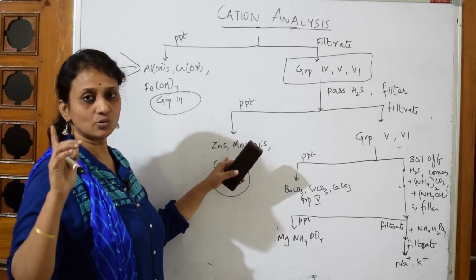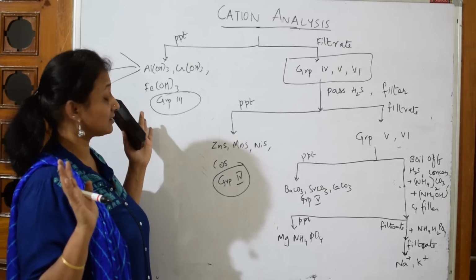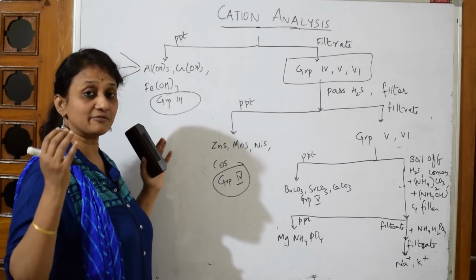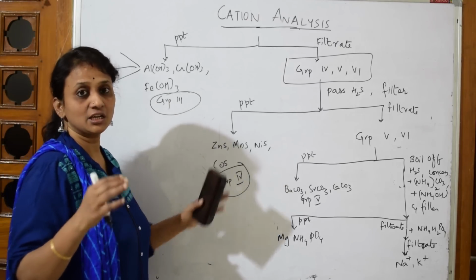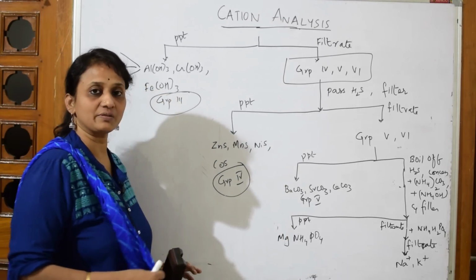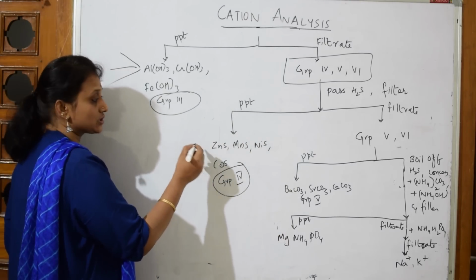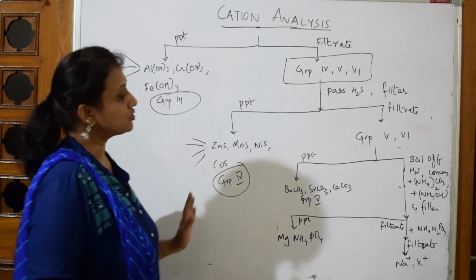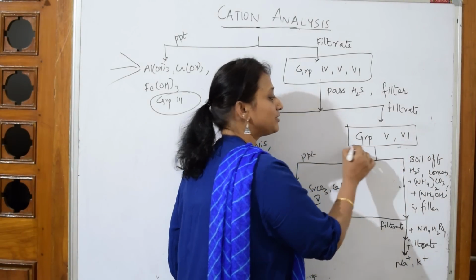First we have written chlorides, like that one after the other. Chlorides we have seen. In the third group we have seen hydroxides. In the second group we have seen sulfides. Chlorides, sulfides, hydroxides and again sulfides. So this is your Viva question. Over. Now once I get this precipitate, I'll be doing the individual confirmatory tests. Done.